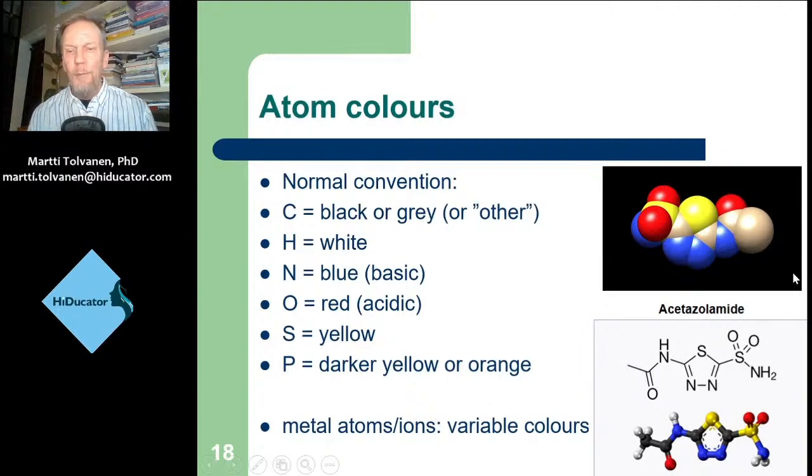But if we have some really strange off color like green or cyan, that could also be an indication of carbons. And hydrogens, when present, which they are not in most PDB structures, would be in white. And for metal ions, we don't have any rules, so if there's a zinc or magnesium, it can be just anything, and when you make your own visualization, you don't break any rules if you choose any color for something like that.